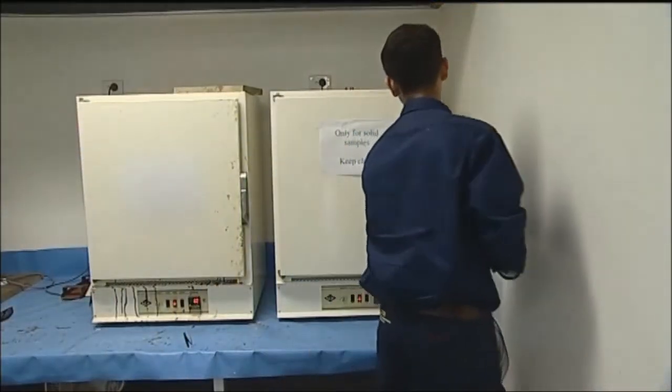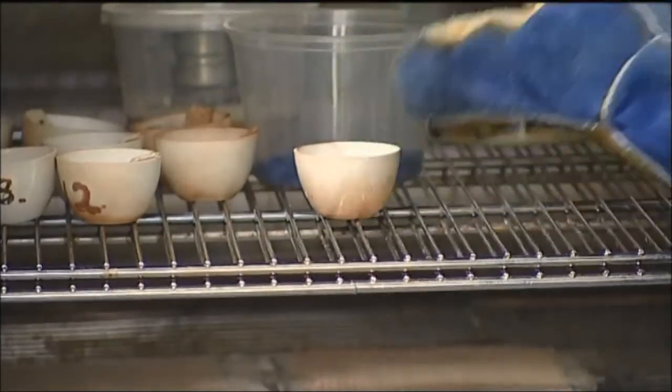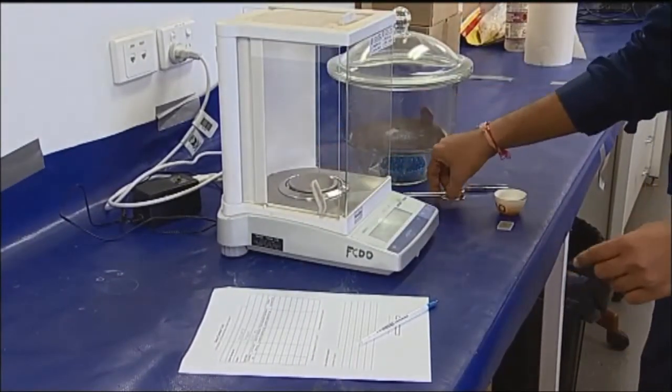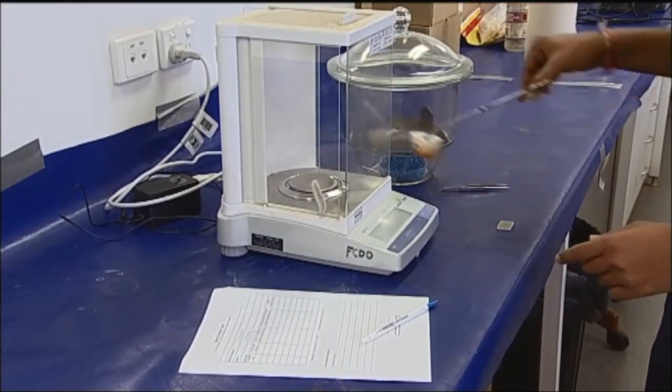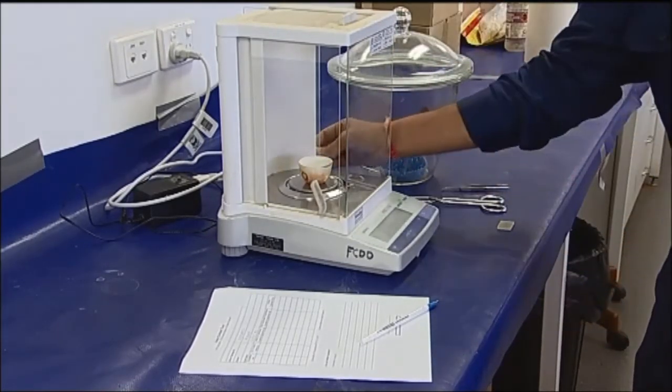The fibre fraction test determines the amount of fibre reinforcement in a composite laminate. A crucible is oven dried at 100 degrees Celsius for an hour and then cooled down in a desiccator at room temperature. The crucible and the specimen are weighed and the values are recorded.